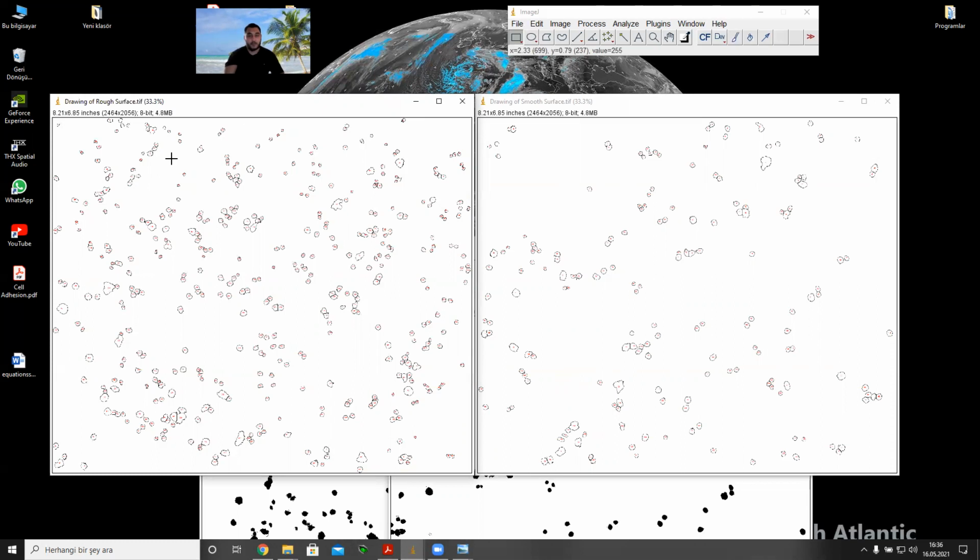It is very clear. But the most important point is understanding the reason for these differences. So we can say that if we increase the roughness value of the surface, the cell attachment also increases. So how was roughness increased? Let me talk about this topic too.